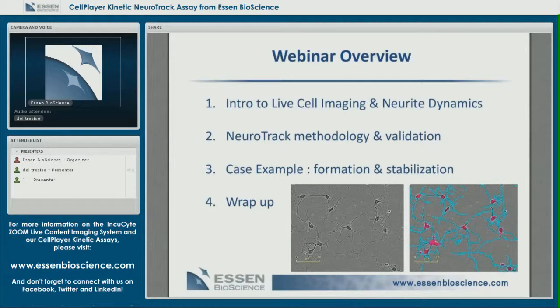The structure of the webinar, which I anticipate will take 35 to 40 minutes or so, is as follows. I will give a brief introduction to live cell imaging and neurite dynamics. We'll then follow that with an explanation of the NeuroTrack methodology workflow and some metrics and pharmacological validation. Then walk you through a case example where we've used the NeuroTrack approach to study the formation and stabilization of neurite networks in human iPSC-derived neurons, and then we'll conclude with a short wrap-up at the end.